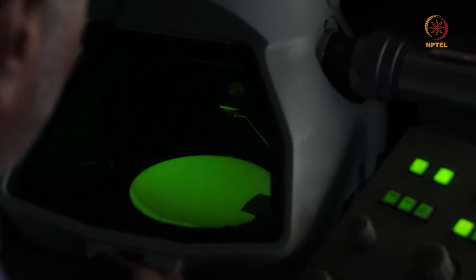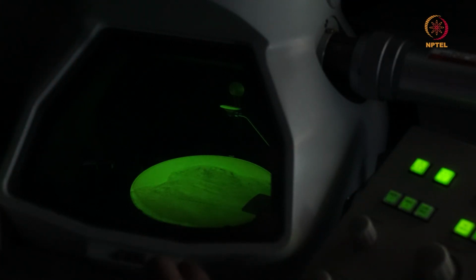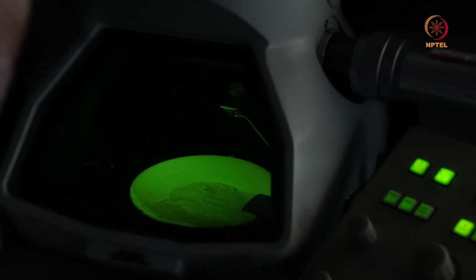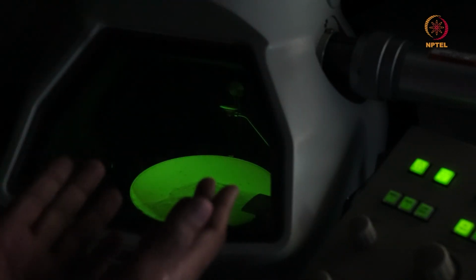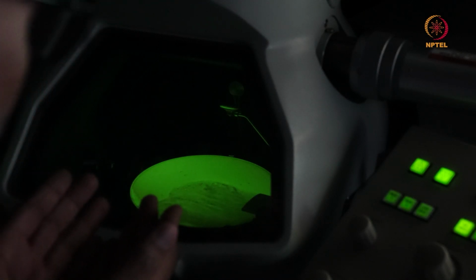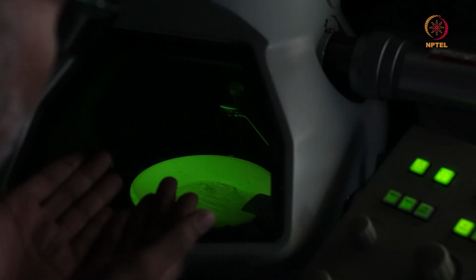Now, I go to the region of interest, to the edge of my specimen, and I start seeing the features here. When I say a bright field image, there is nothing in the path of my electron beam other than the specimen, and I have a bright background and the specimen features appear darker.